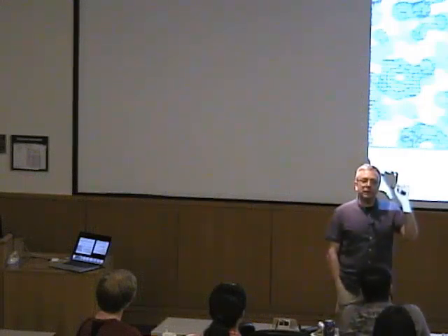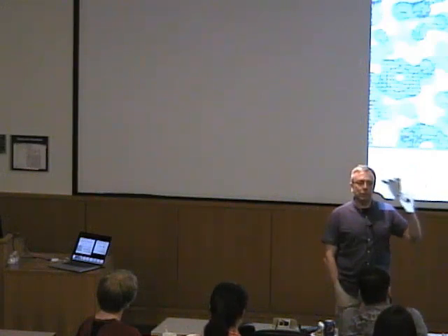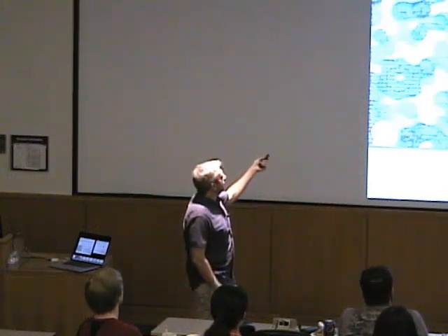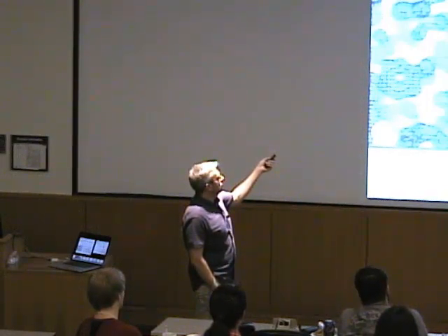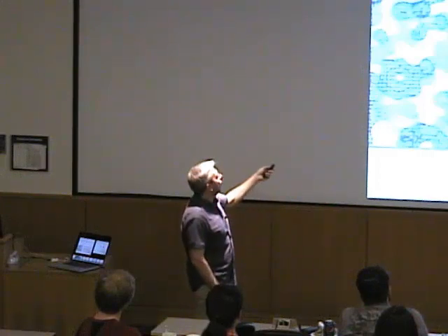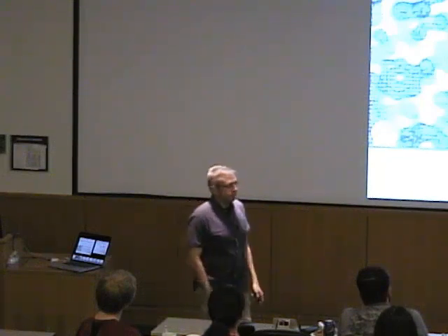We only have diffraction information for HKL as integer values for only given points in space. And yet, after the Fourier transform, we can calculate electron density at every point XYZ in space. This is discrete, this is continuous, and that works. And this is the formula. It's actually the only formula we ever need to get us from the diffraction image to the electron density map. Okay.